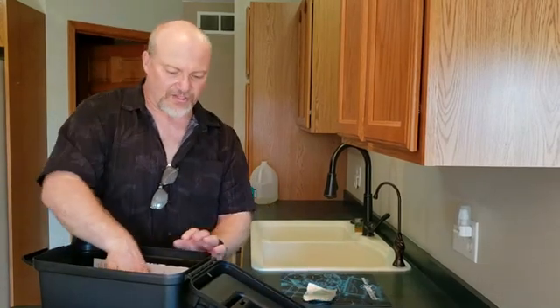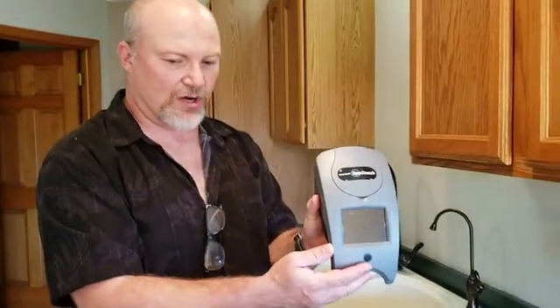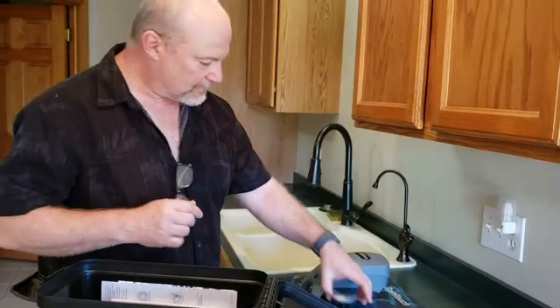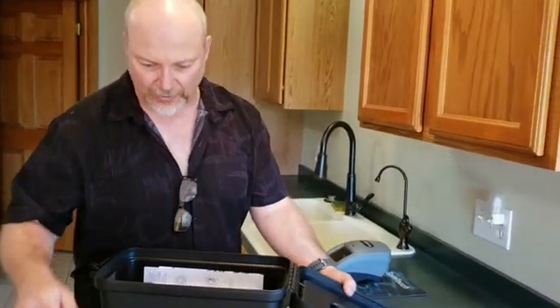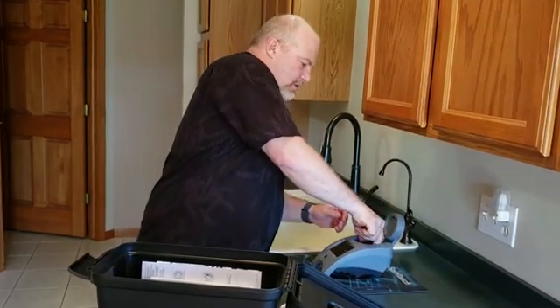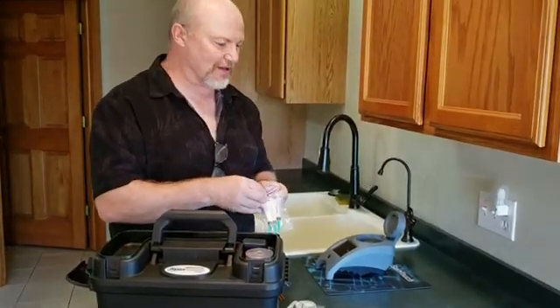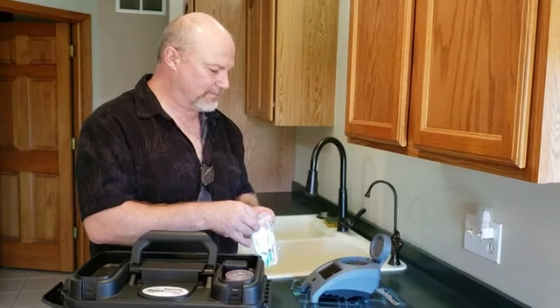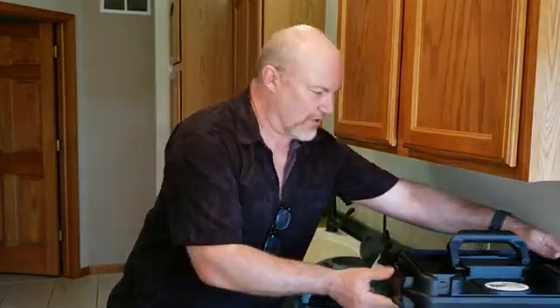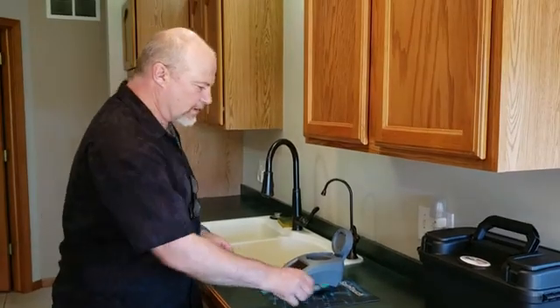So this is the machine here and I'll show you how that works in a moment. It comes with a nice little pad. We'll take the disc out — there are a couple of little things, a disc cover that you put over the top of the disc. We'll grab one of the syringes out of the pack.